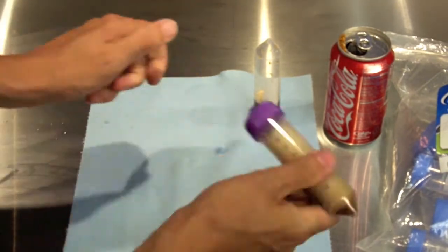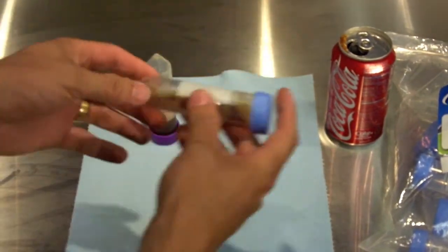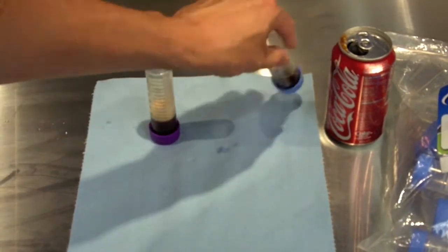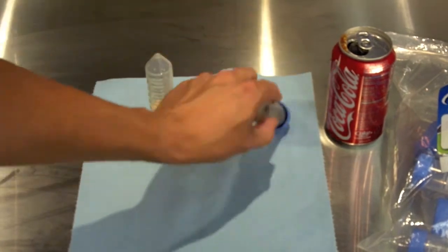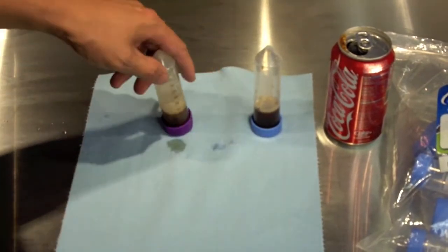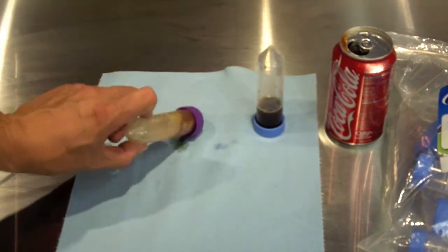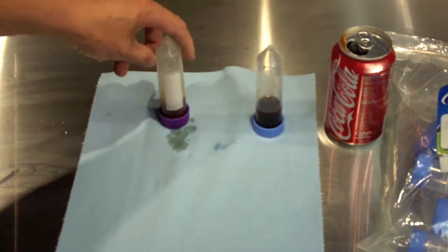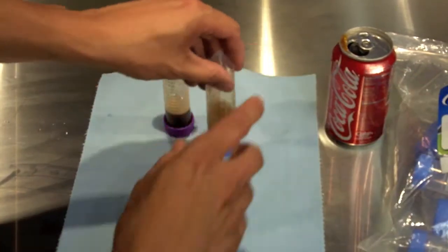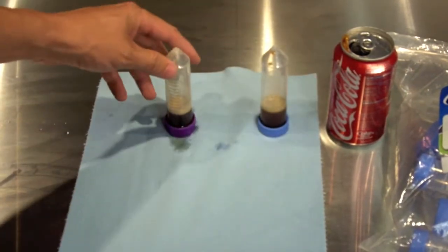What you want to do is be assured that your sample is safe within the tube. You notice on this tube that the sample is indeed leaking out. But with the Xtreme Gene tube, nothing is coming out.